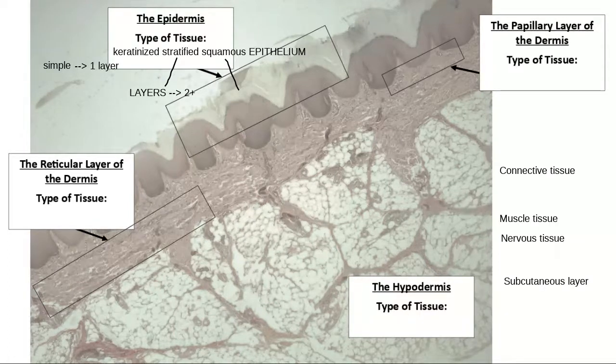Yeah, so I see a couple of us mentioning in our chat here, these are our squished cells. Absolutely, I love that. These are going to be really flat. They're going to be kind of spread out and thin. So it's hard to tell on this picture. We're going to look at some other ones where you can see it better.